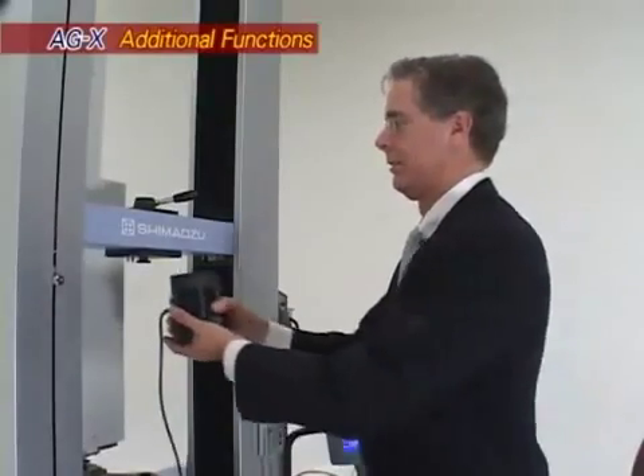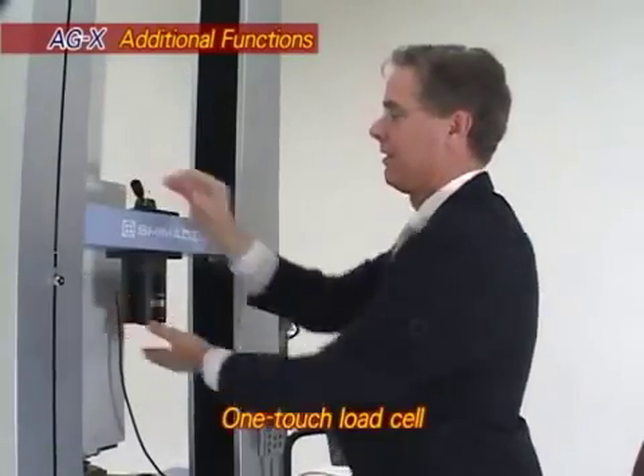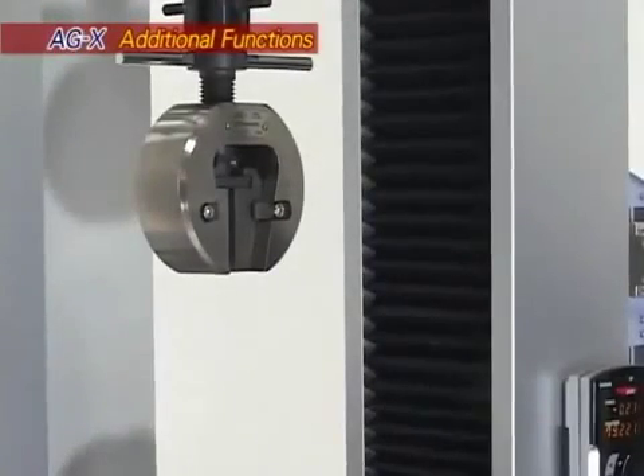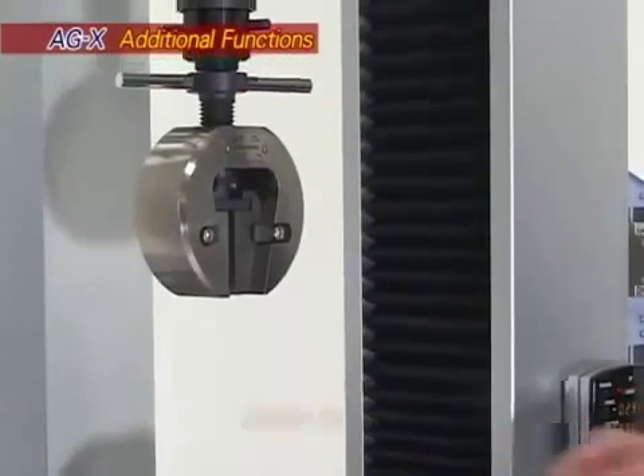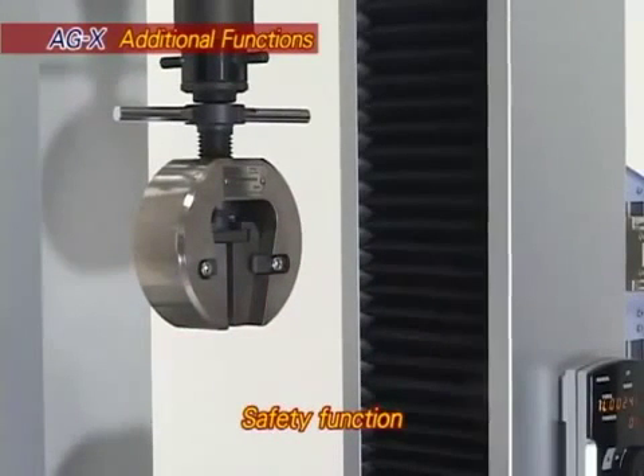The AGX is equipped with many other additional and useful new functions. Previously time consuming, the AGX system was improved to allow load cell installation in a single step. A safety function prevents jig damage and accidents by automatically stopping the machine if more than a designated load is applied to the load cell during manual operation.